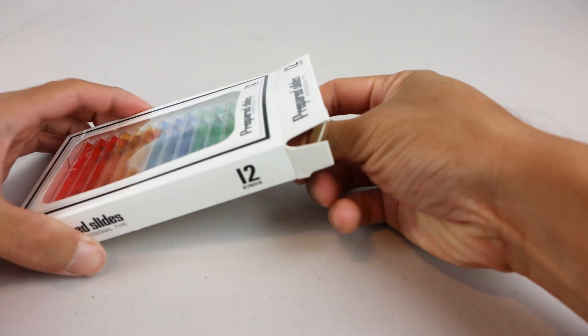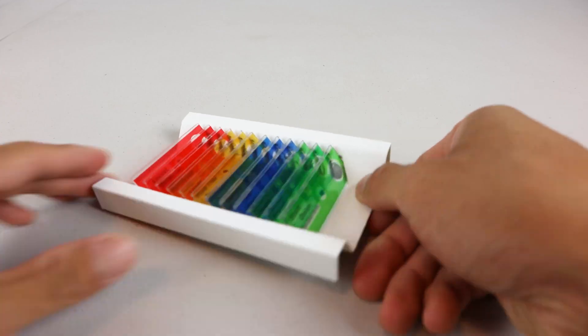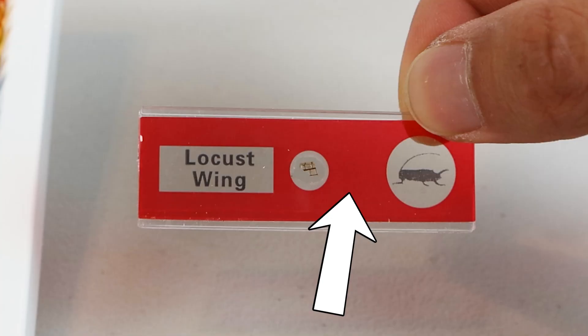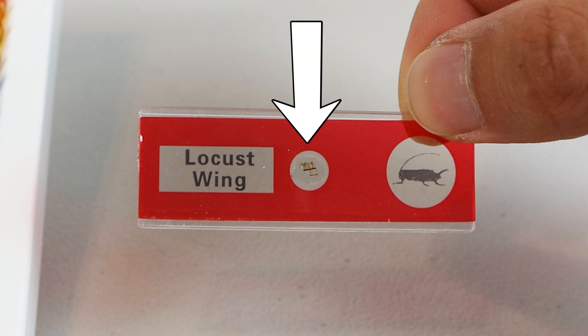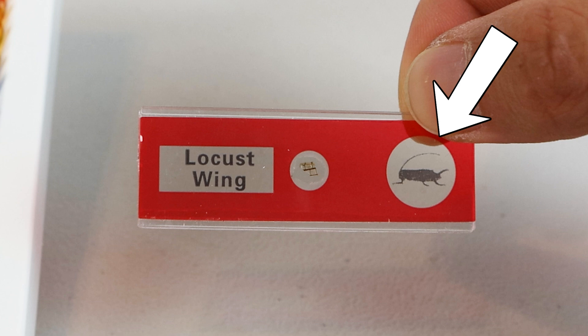Let's have a look at some of the included slides. Each slide has a colorful background, a label on the left-hand side describing the sample, the sample in the middle, and a graphic on the right-hand side which shows you where the sample came from.